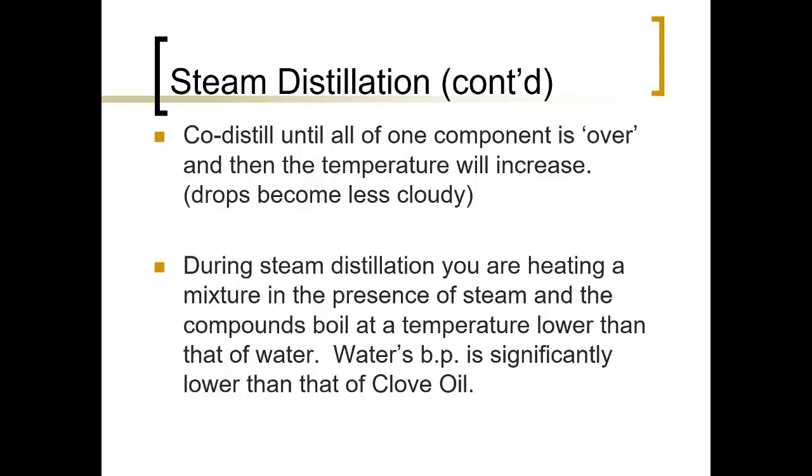But you'll notice initially the water is clear, as mostly water is coming off, and then it starts getting cloudy as you get to a temperature in which the clove oil and water starts coming off. You're going to keep adding water into your distillate to make sure that you don't run out of water.